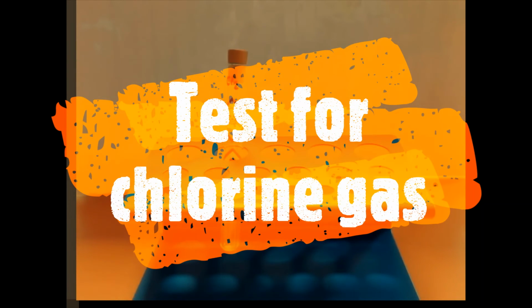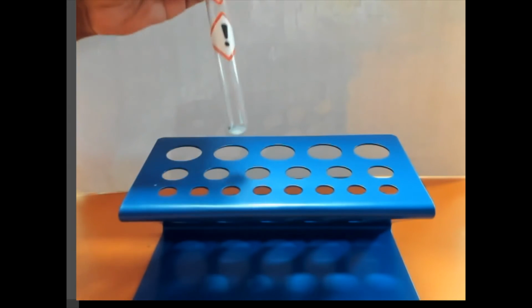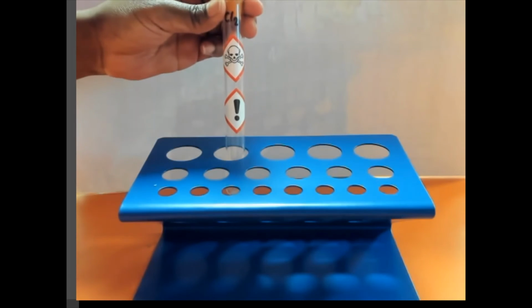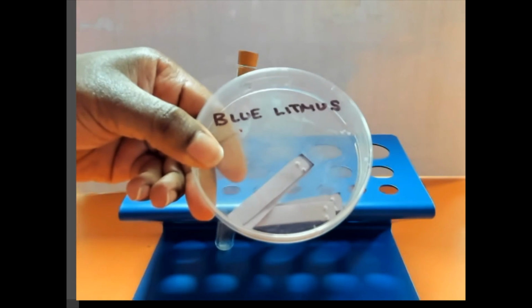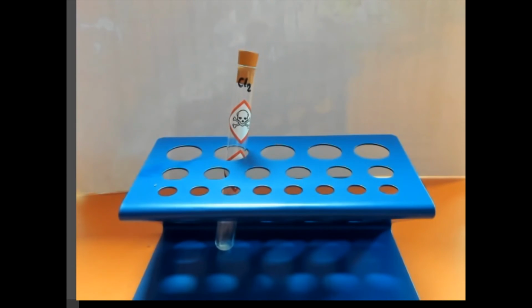Our final gas test will be testing for chlorine gas. Now we're going to be very careful with this because, as you can see, it is toxic and it is an irritant as well. Now to do this test, we're going to need blue litmus paper. So we're going to be using blue litmus paper. What I'll do is put this litmus paper at the top end of the test tube and then observe for any color change.